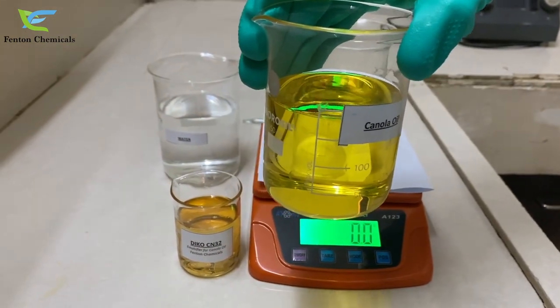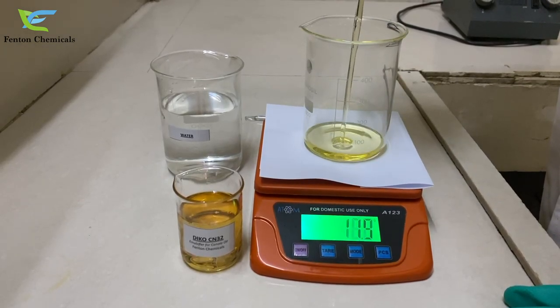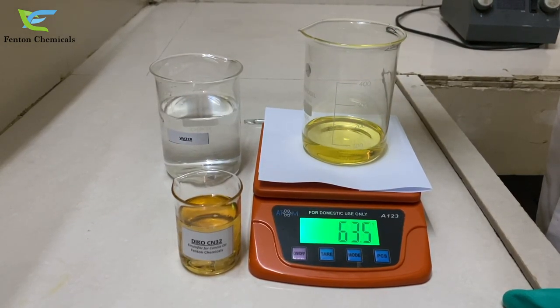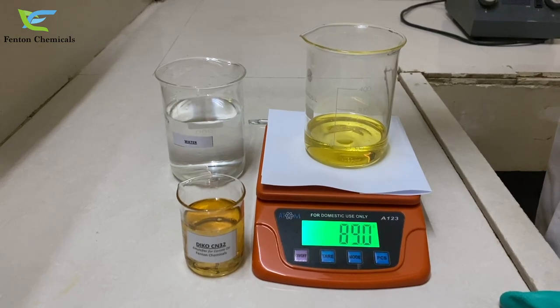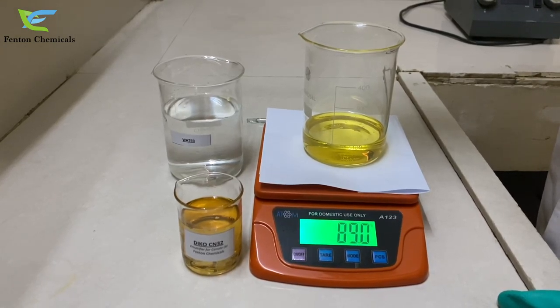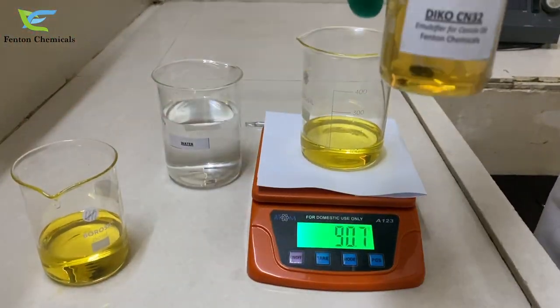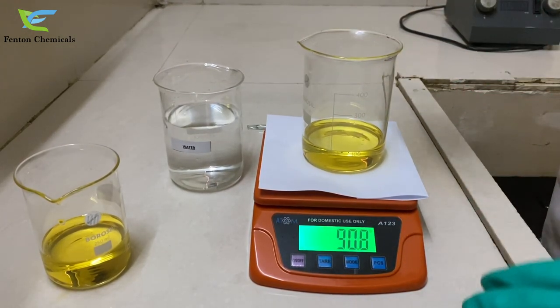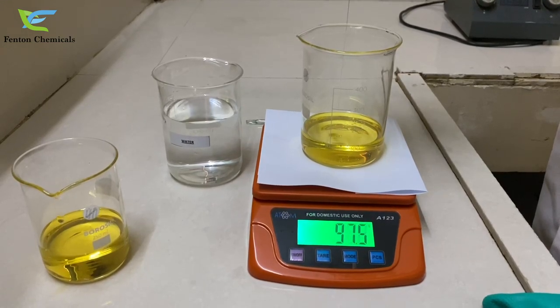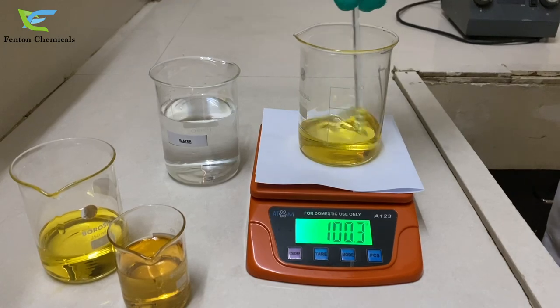First of all, we will take 90 grams of canola oil in the beaker. Now we will add 10 grams of emulsifier Deco CN32 to it. We will mix the solution properly.